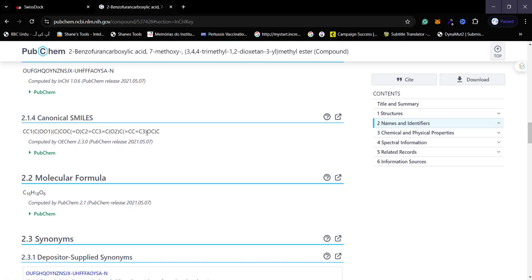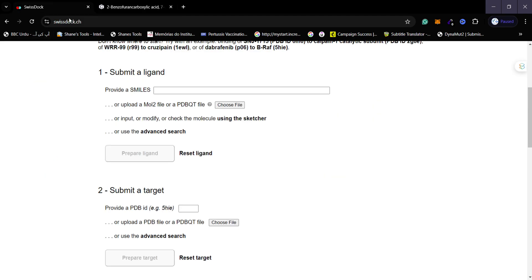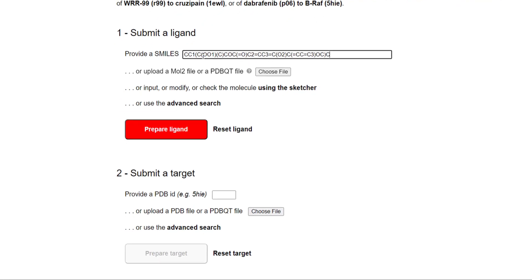Another important question is: why are we recommending SMILES instead of uploading a PDBQT file or MOL2 file? Sometimes, if you build the 3D structure of your ligand yourself, you can make mistakes in the ligand topology. Therefore, it is advisable to let SwissDock build the 3D structure of your ligand by itself. We hope that the standard procedures of SwissDock will not make any mistakes.